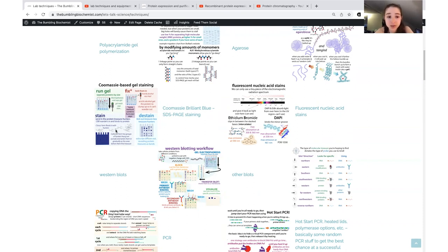So it's going to bind to the proteins and then, because it's blue, the proteins will look blue. But in order to see that, you have to wash everything out. There are also colloidal-based methods. A colloid is little groups of these dye molecules. Well, it doesn't have to be a dye molecule, but in this case, they're colloids of dye molecules. And so those colloid forms can't go in, but the monomer forms can, so the individual ones.